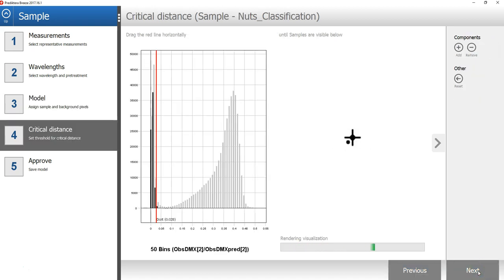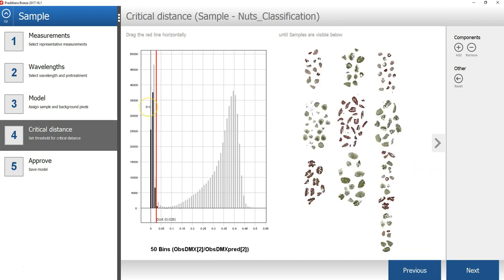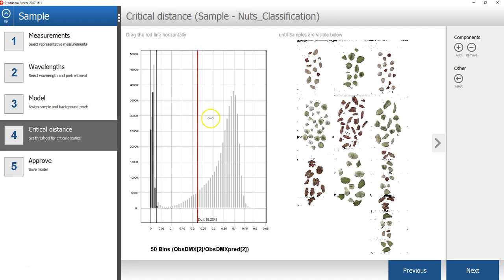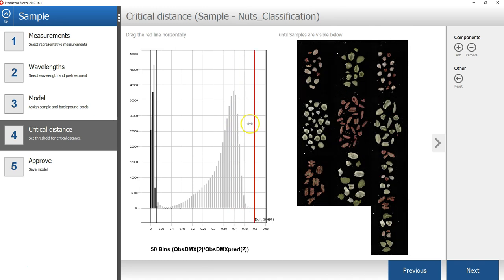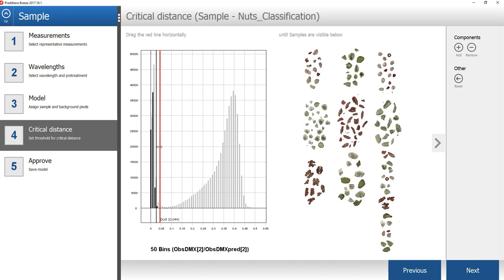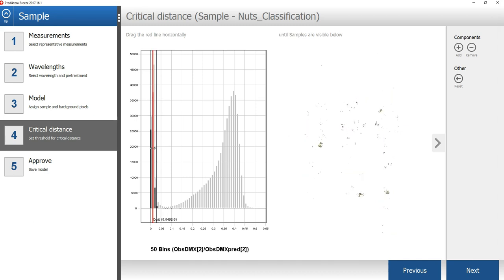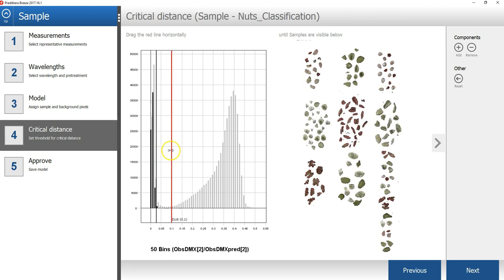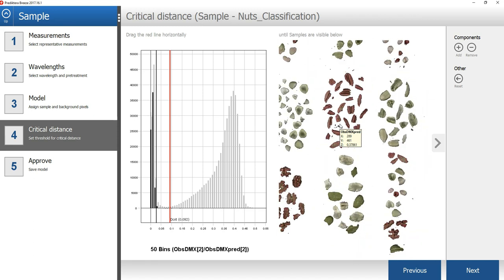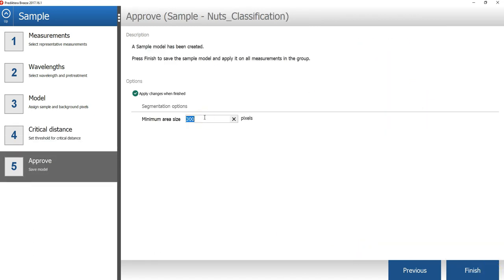In the next step of the wizard, you will select the critical distance threshold. This is the distance to the sample model and will be used to determine if a pixel is a sample or not. Drag the red line in the histogram to the right to move the threshold. The aim is to find a level where all the sample pixels are included but not pixels belonging to the background. In the last step of the sample model wizard, you can set a minimum area size. This is used to automatically exclude smaller objects that are unwanted, like dust or dirt. In this example, any objects under 300 pixels will be excluded from the image.